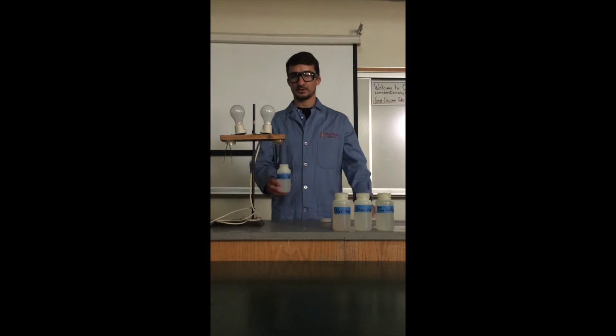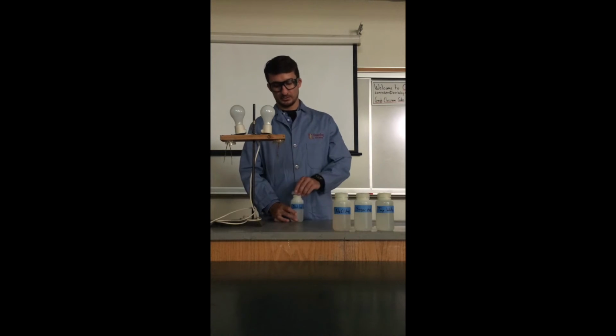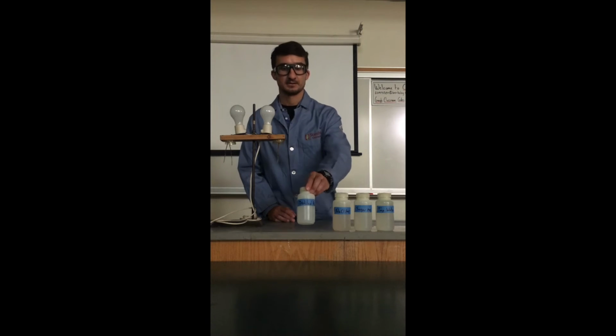Here you go, distilled water, 1, 2, 3. Nothing. So pure water, distilled water, does not conduct electric current.